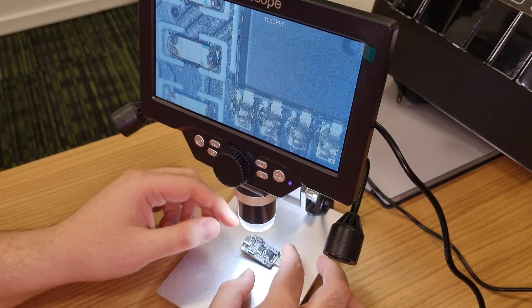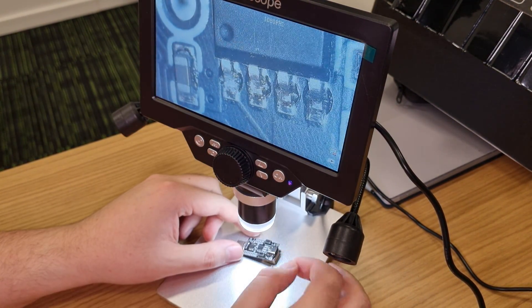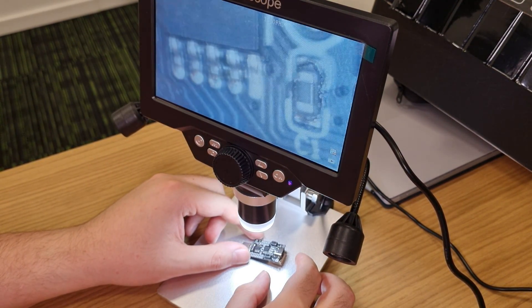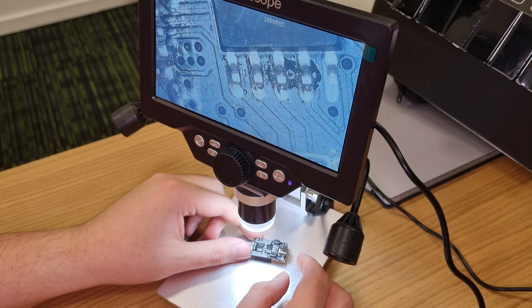Unfortunately the build quality is terrible, but this thing is working. Look at those solder joints — it looks like someone put a drop of tin and heated it up. Yeah, it's really nice.